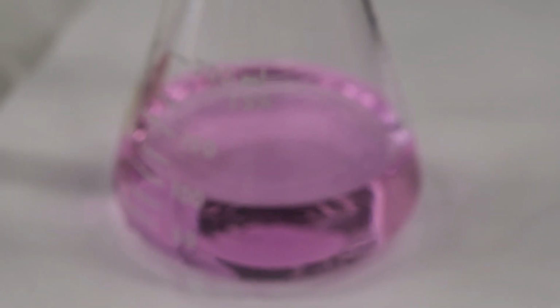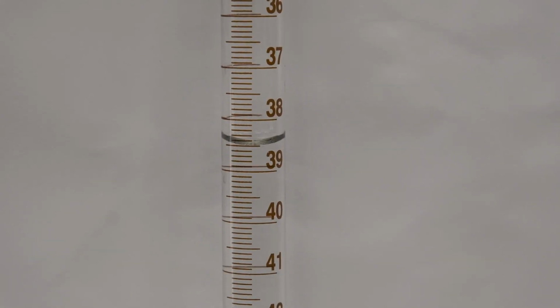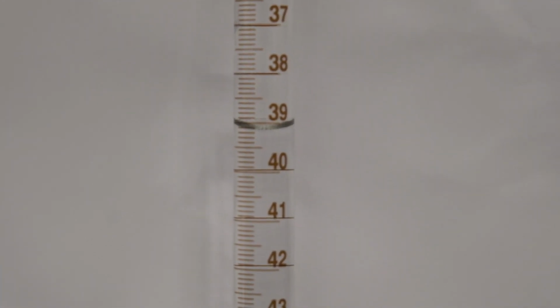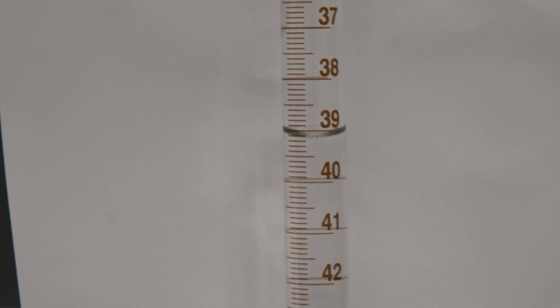Number of significant figures for sample one. Okay, this is the final burette reading for trial two, so read to the correct number of significant figures. This is the final burette reading for sample three after titrating the acid. So record to the appropriate number of significant figures. The final burette reading for sample four, so record to the appropriate number of significant figures.